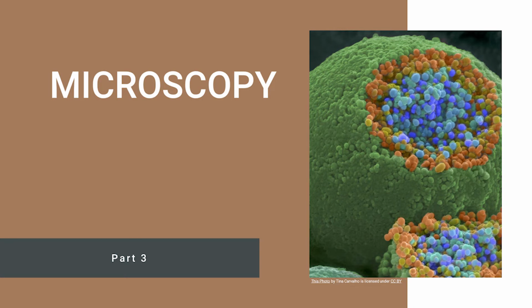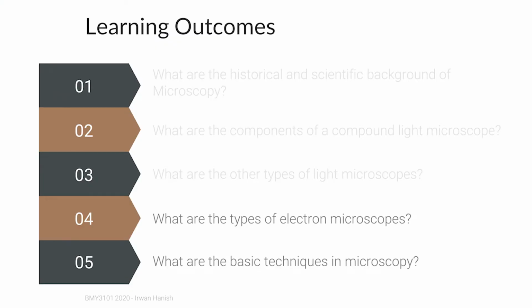Bismillah, Assalamualaikum warahmatullah. You're listening to a microbiology lesson on microscopy. This is part 3, and in this episode we're going to cover the common types of electron microscopes.